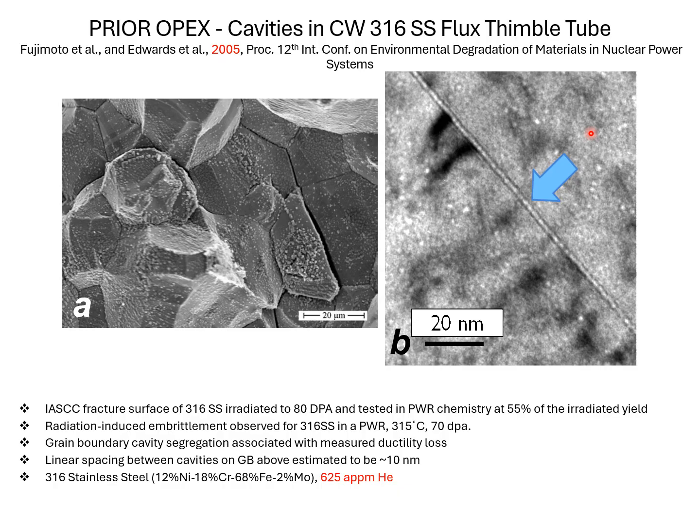And historically, people haven't identified them, I think in part because you don't use your best microscope to examine irradiated structures, and typically people would use old equipment that's not very well aligned and doesn't have the resolution to image bubbles.